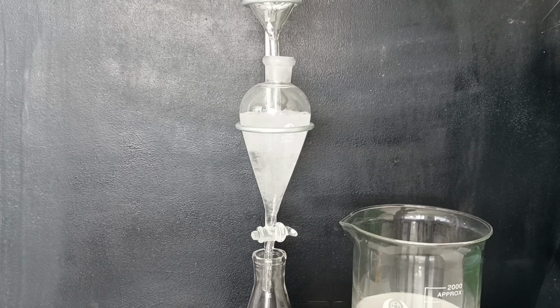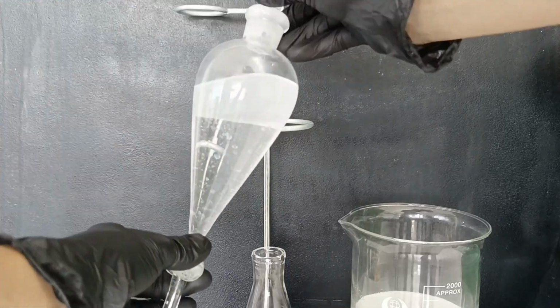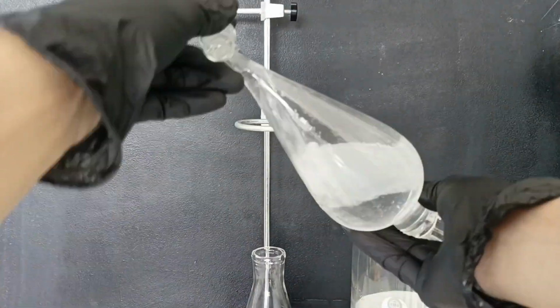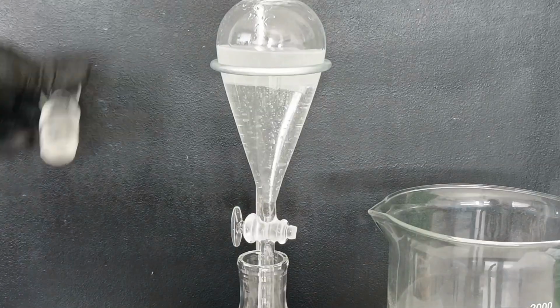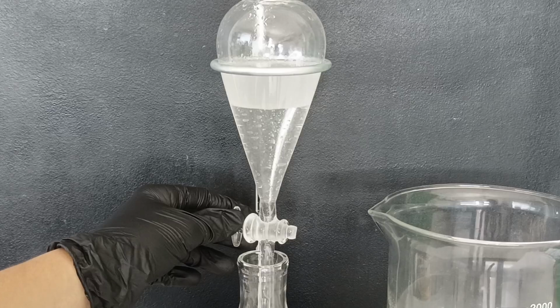I added some more water, and then the separatory funnel was capped, shaken, and vented. The layers were allowed to settle, and then I drained the lower aqueous layer into a separate beaker.